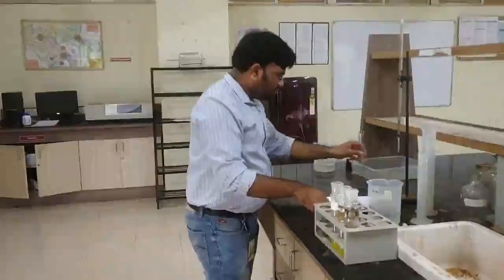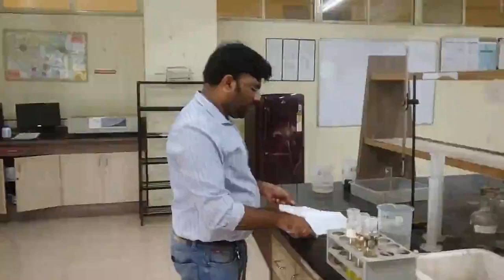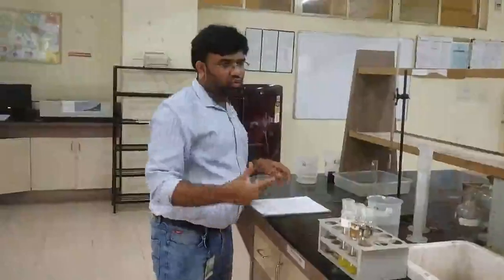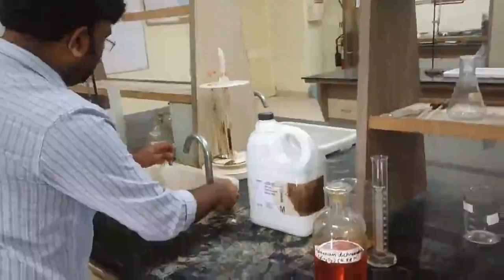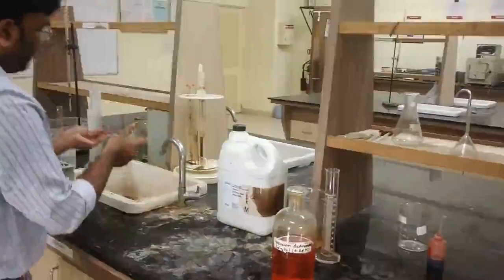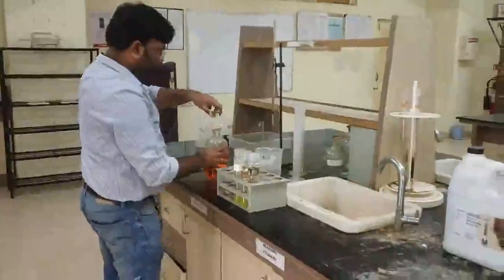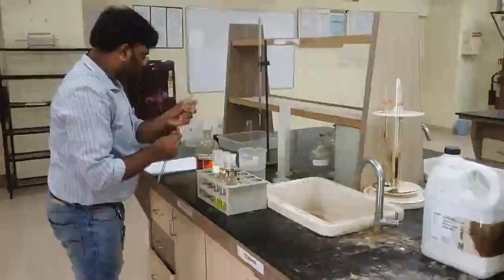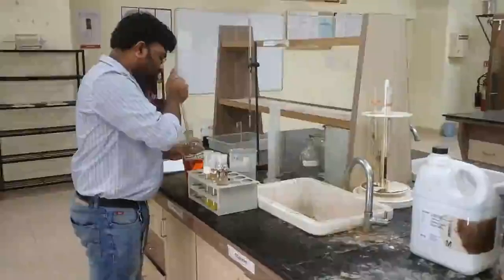The next procedure, according to this procedure, is to add 10 ml of 0.25 normal K2Cr2O7, which is our oxidizing agent, right? A very important liquid. So 20 ml of sample has been added. Now we are going to add, with the help of a pipette, 10 ml of K2Cr2O7, which has 0.25 normality, in each of these flasks.